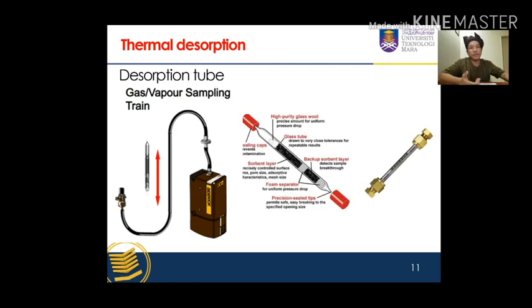These tubes are used to concentrate volatile compounds, for example from air samples in the environment or workplace. In this manner, air in the atmosphere can be regularly monitored. By placing the inlet of the tube at the suspected source of contaminants, a measured volume of air is pulled through the tube containing the sorbent by using an air sampling pump or vacuum pump.